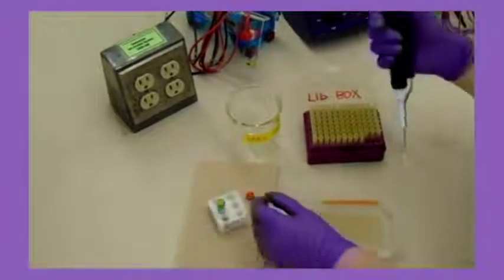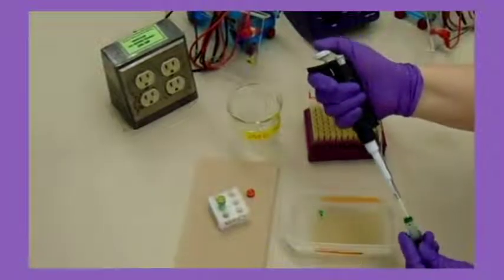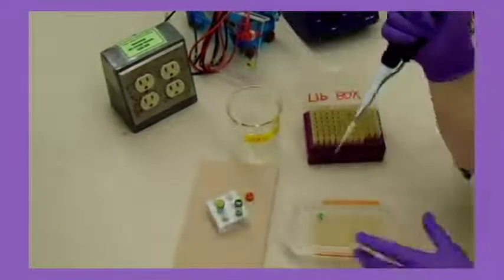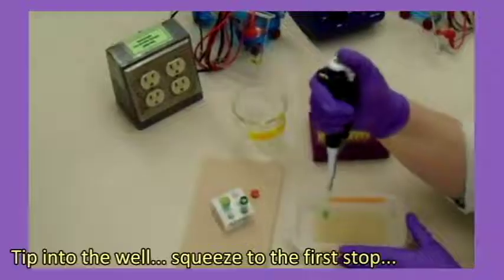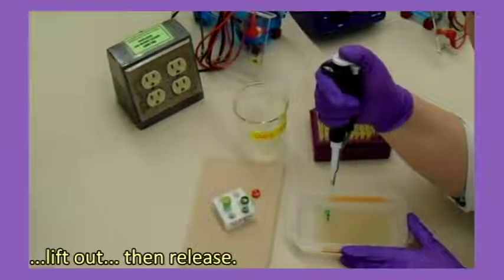One more time. Get a yellow tip. Press the plunger to the first stop and hold. Put the tip in the dye and release. Tip into the well. Squeeze to the first stop. Lift out, then release.